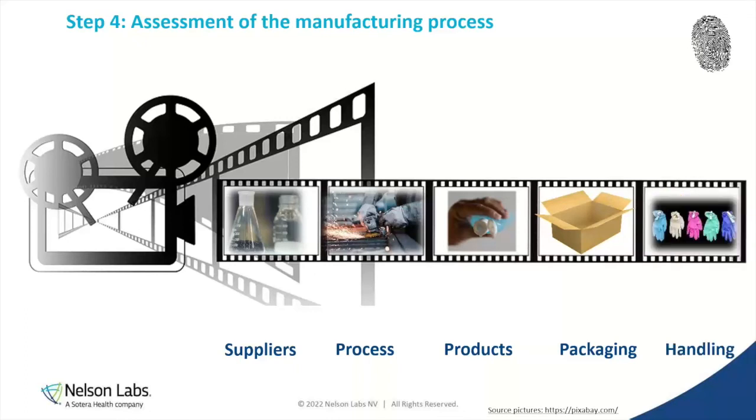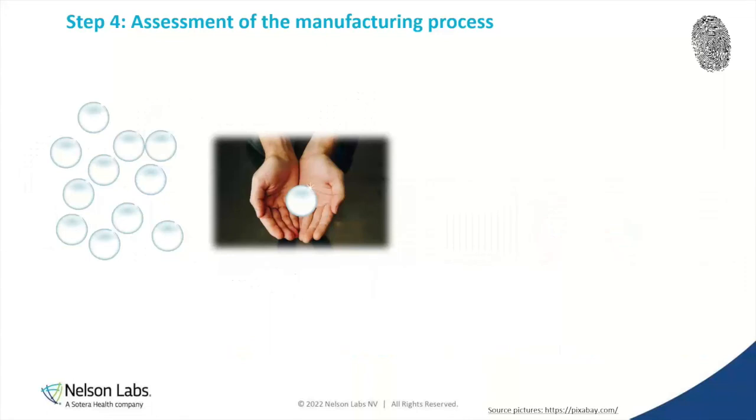Okay, this last one, thinking about a change in handling. I have an example of this where we had a client that would use glass beads. It was part of a raw material that they would get for their device. These glass beads had a lot of hand manipulation through the process.